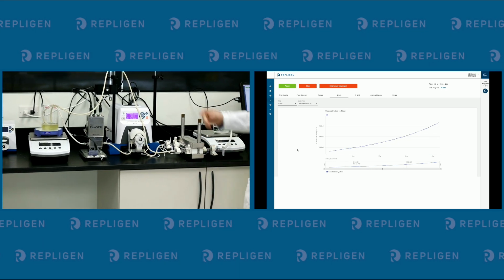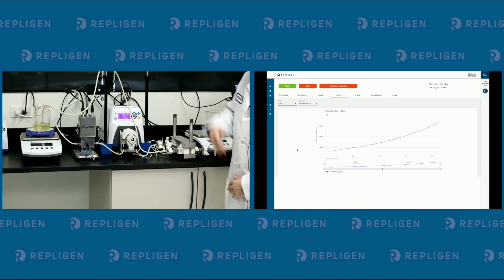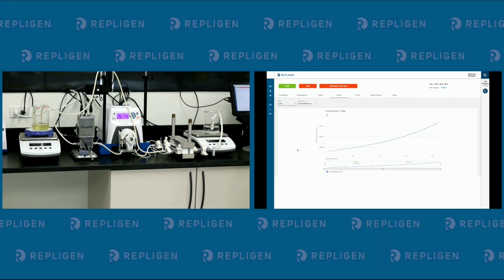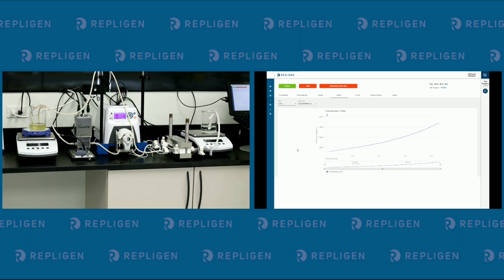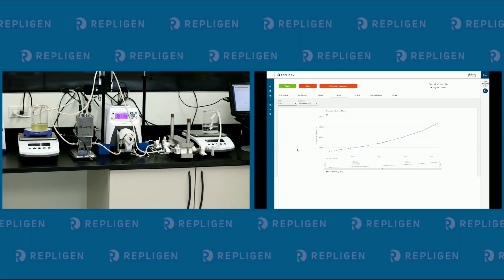And it also has a bunch of pressure sensors. So it's telling us the feed pressure, the permeate pressure, the retentate pressure, and the TMP. So we're running at a 10 PSI for TMP. We have our flat sheet membrane cassette holder, which is, again, like James mentioned, I'm using a flat sheet today. However, you do have the ability to do hollow fibers. So we have a few consumables to show you today, just from the lab.